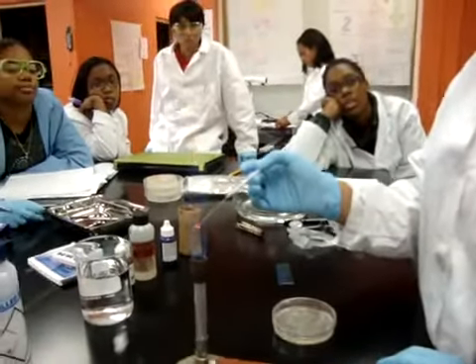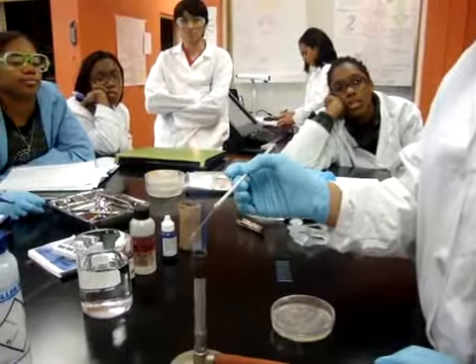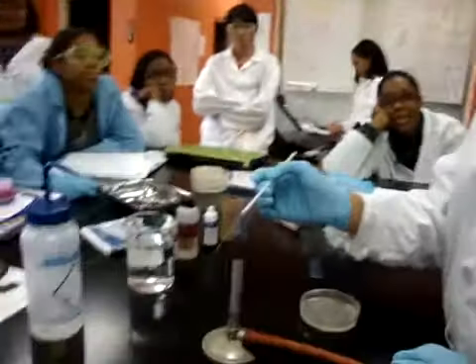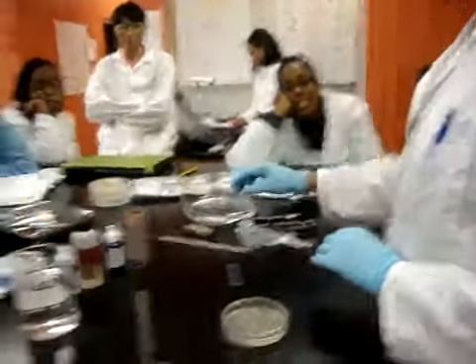That's why you want to make sure that tip gets red hot so that you incinerate it. So there's no chance of it living anymore. Okay, so I'm done with that.